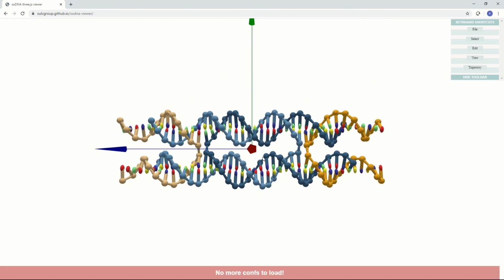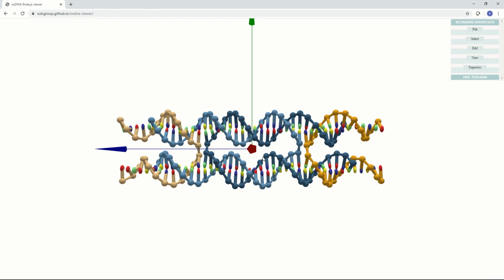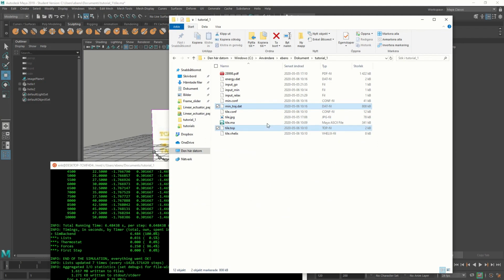So it's sort of tightened the simulation up, and it's removed any possible overlaps that may have been in the file, and this is just a good visual inspection. And if it still doesn't look good, you might have to run more steps of this, but it looks good to me.